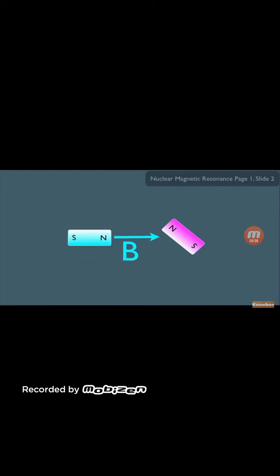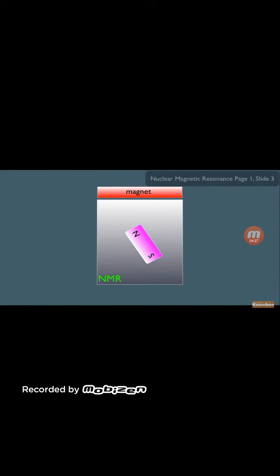So now let's talk about what happens in a machine such as the NMR. Let's say we're putting this in our NMR like this right here. And just think of the NMR as simply containing a chamber where a magnet or a sample could be inserted, and that chamber is being influenced by a big magnet here in red. And let's represent our magnet as our vector here like this. This is expressing its orientation. هذا magnet أصلاً في ال NMR. We turn on the magnet of the NMR, and when that magnet gets turned on, this is the direction of the magnetic field that it creates. And we're going to call that the applied magnetic field. It's simply the magnetic field applied by the magnet in the NMR.